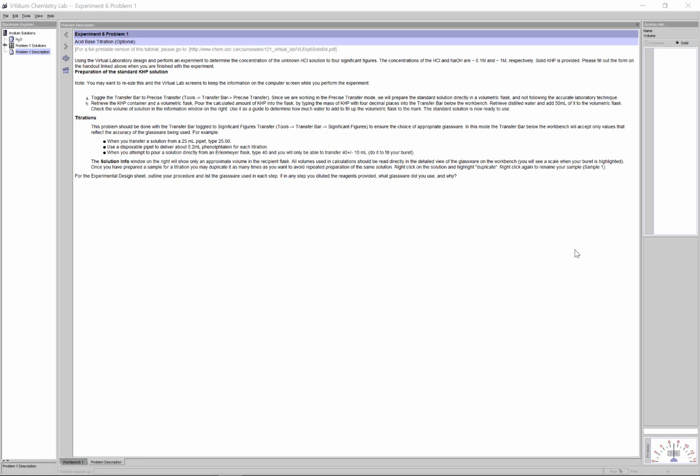Morning, guys. So yesterday we introduced the chemical technique of a titration. That technique is very commonly used to find the concentration of an unknown. We saw how we did that: we ran it through a chemical reaction. Our unknown in our example was an unknown concentration HCl. It could be really concentrated, like really high molarity, or it could be really, really dilute. How we actually figured out how much HCl there was is we reacted it with controlled amounts of NaOH.